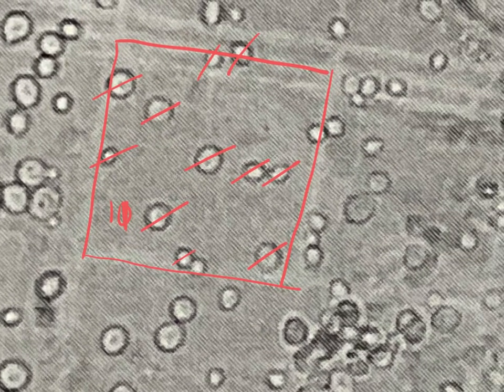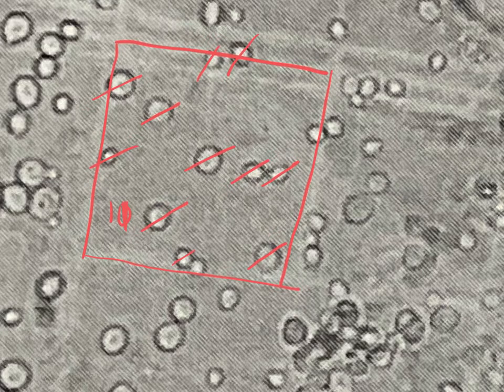So what you want to do is go around a C-square. Choose wisely. Don't choose one with a big clump, or one that's got a cell touching the bottom and the left. So remember the rules: count cells totally inside or touching the top and left. Ignore bottom and right.